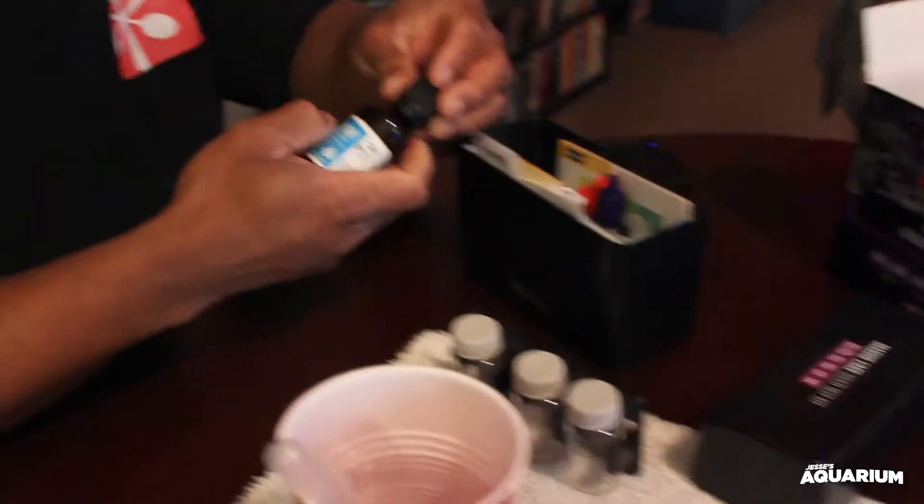Alright, so now we're going to see how this works. I'll start off with the pH first since that's the first one listed. It says use the syringe provided — you need at least 5 mils of water into the glass vial. Now it says just add three drops of the pH indicator and then shake for 10 seconds.